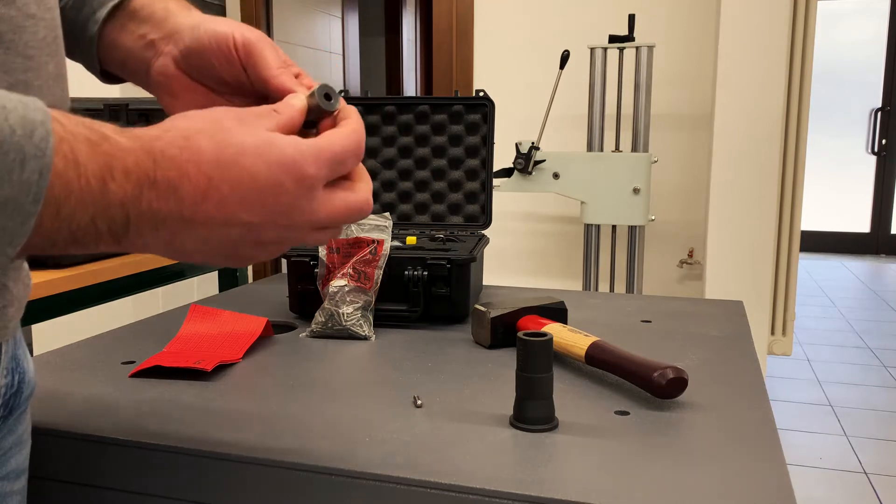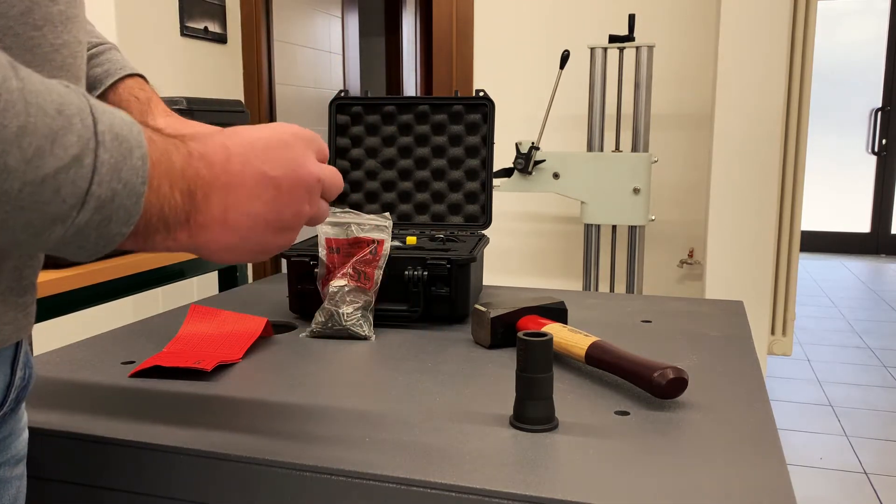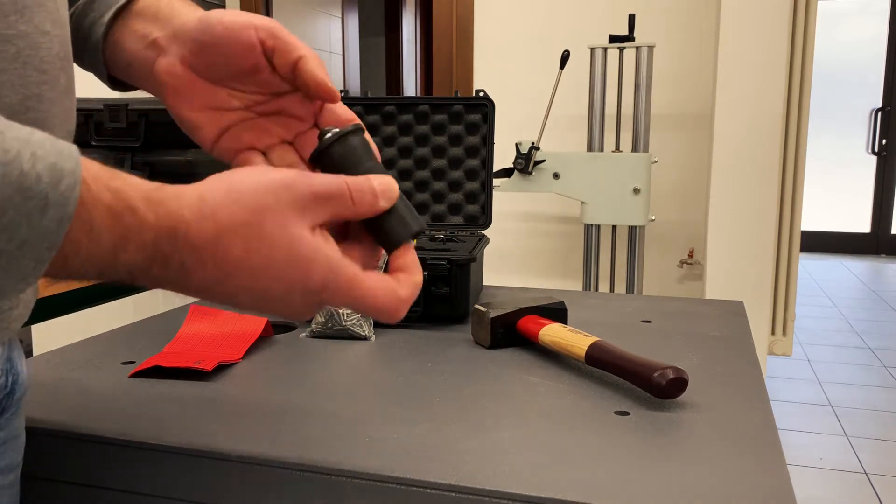SDE is the standard for the economical measurement of Brinell hardness. It can be used on the entire Brinell range, HB100 to HB700.